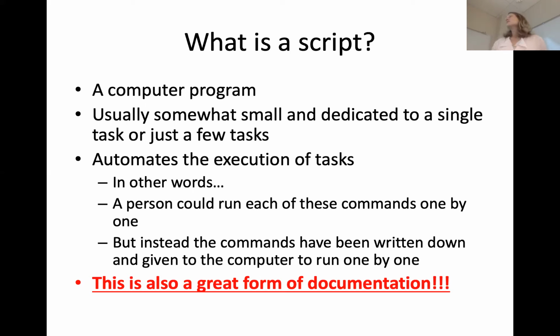And this also serves as a great form of documentation. In my lab, if we're going to run an analysis step, we put it in a file, save the file, give it to the computer. That text file that has the actual thing that you ran will be there in 6 months. It'll be there in a year. So it's a really good form of documentation.